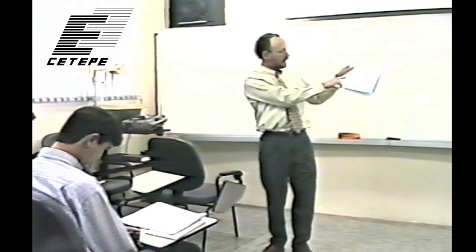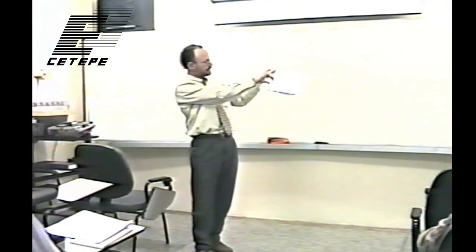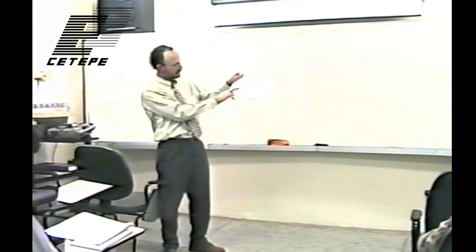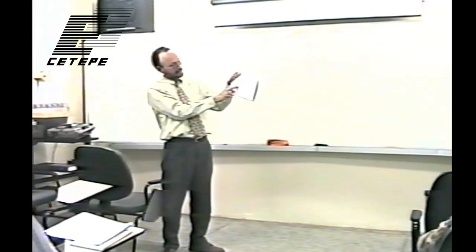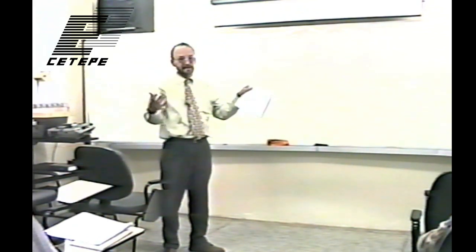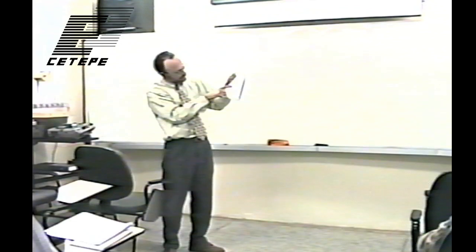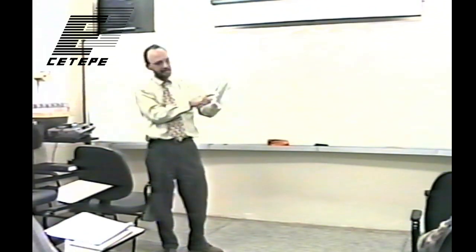So if you look along the top axis, you'll see it's a logarithmic axis. So any movement to the left or right can be very significant. But most notably this. Not all the X-rays are absorbed, so you have this slight decrease initially. But then, of those that are absorbed, it's a direct energy conversion. So you take 100 keV, for instance, and divide it by 2. So you get thousands and thousands of visible light photons, which is, you go from roughly 10 to the 5th, or actually maybe 5 times 10 to the 4th, all the way up to, looks like 10 to the 8th. Okay, so that's the huge gain there.